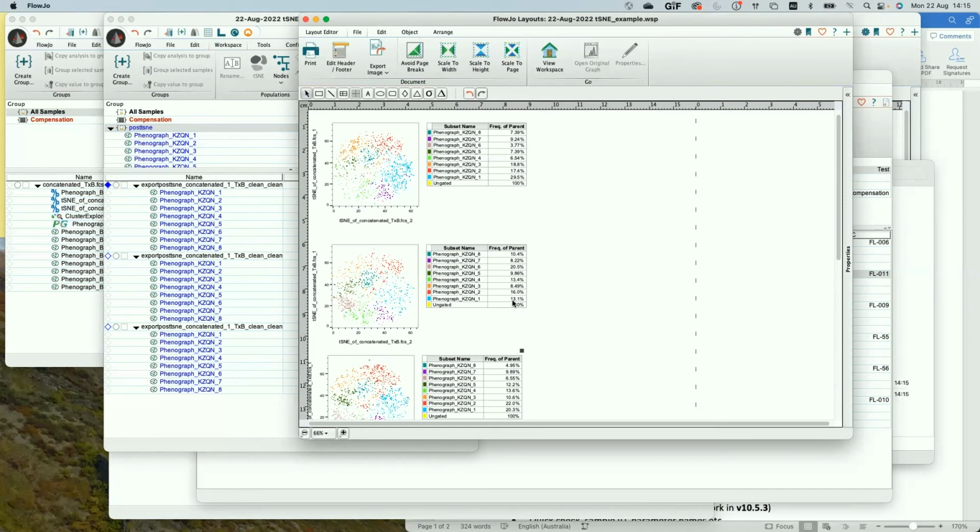You know, there's one here that's missing in one of the populations, for example, and then that's where you go and start playing around with ClusterExplorer to look at the phenotype of these clusters and have a think about, right, well, which ones are changing drastically by at least two that look like they're really different between my cohorts, but then biologically, does that make sense? Is that even an interesting population?